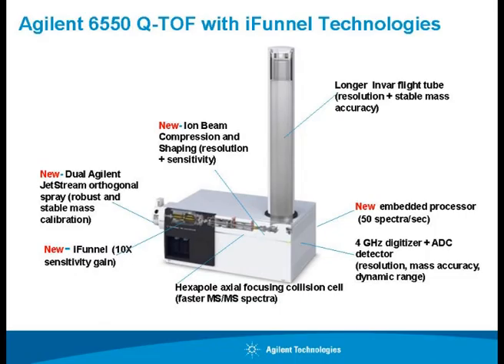Okay, and it travels through the quadrupole, then you can trigger an MS-MS and then it can be measured in the time of flight. Okay, so why quadrupole and why time of flight, maybe we will discuss when we actually go into the lab, when you can see it, like there are various modes, and then you can realize, okay, why not only TOF? If TOF can do everything, as I told, accurate mass and resolution, then why do we need a quadrupole? Okay, so we will see that.